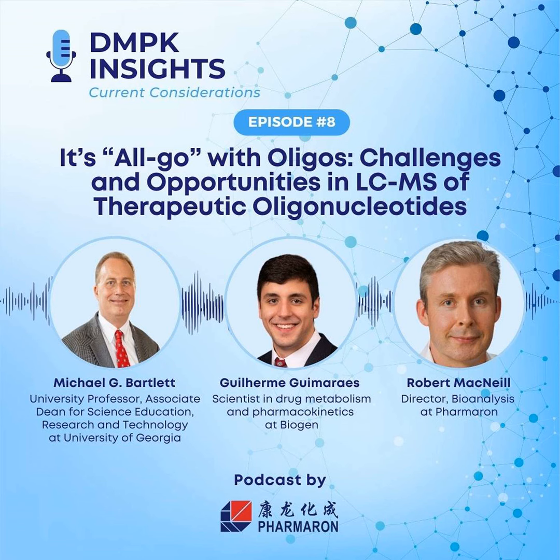So I think the real problem at that point is that we were struggling with poor sensitivity. We didn't really know why we had it. But I think, at this point, we've recognized that acetate is a major contributor to poor sensitivity in LC-MS using ion pair or reverse phase analysis of oligos. And we were able to finally break free from that when we replaced acetate with hexafluoroisopropanol or HFIP. And I think that really sort of got the field moving forward again. And you've started to see people then trying to optimize the ion pairing by playing with the different alkylamines and the different fluoroalcohols at that point.